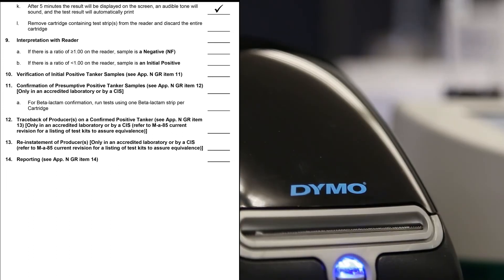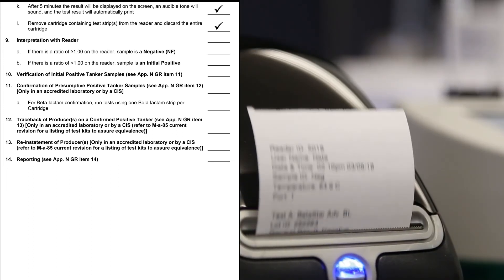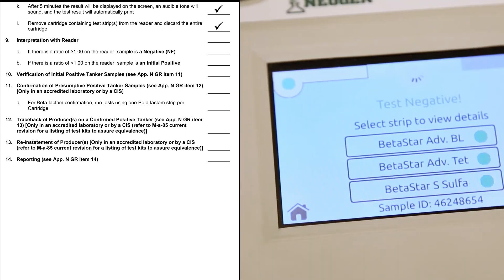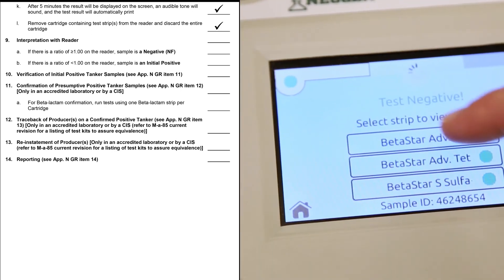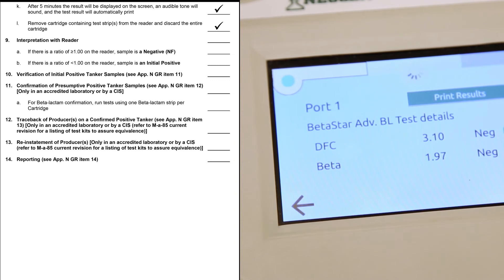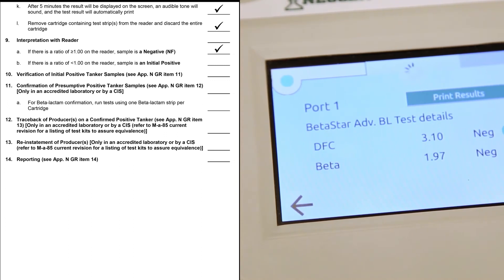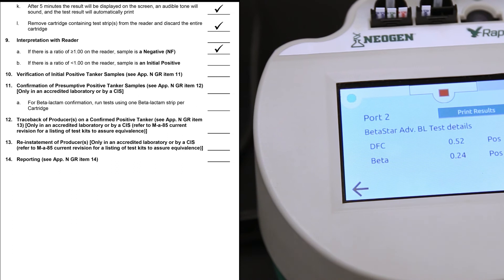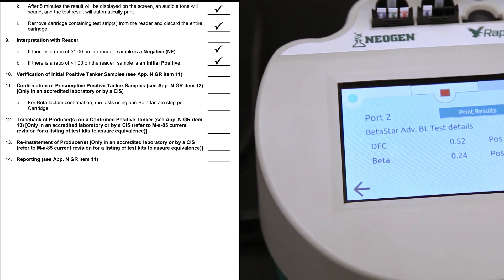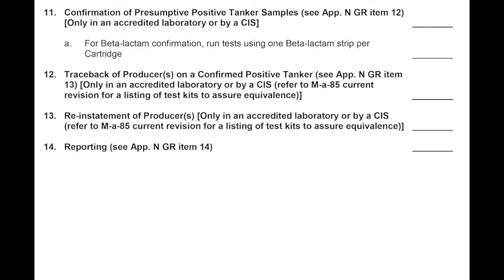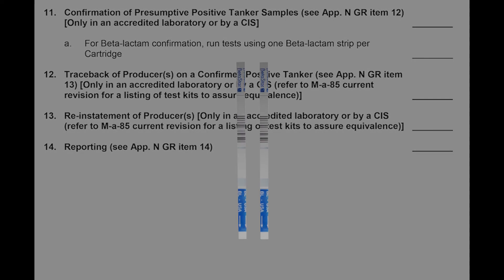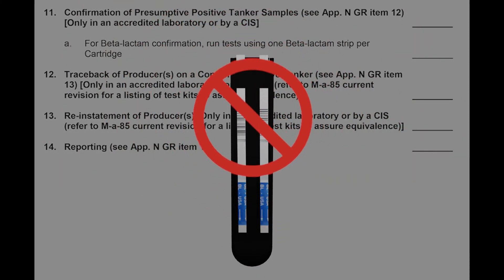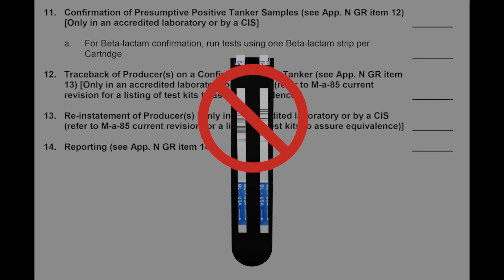Remove the cartridge from the instrument and discard. Touch any given result to see details. If the ratios are greater than or equal to 1.0, the test is negative. If the ratio is less than 1.0, it is positive. For presumptive positive and confirmation testing, you must run two different cartridges containing a beta-lactam test strip with your positive and negative controls. Two beta-lactam test strips cannot be added to the same Raptor cartridge to run the sample in duplicate.